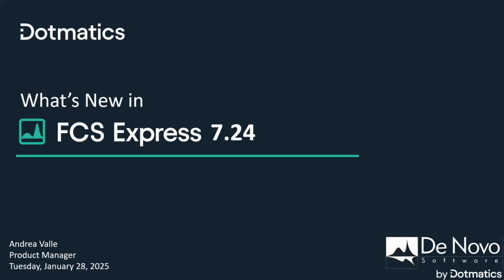Hello, everyone, and welcome to this webinar on what's new in FCS Express, and especially what's new in FCS Express 7.24 that was released soon before Christmas.